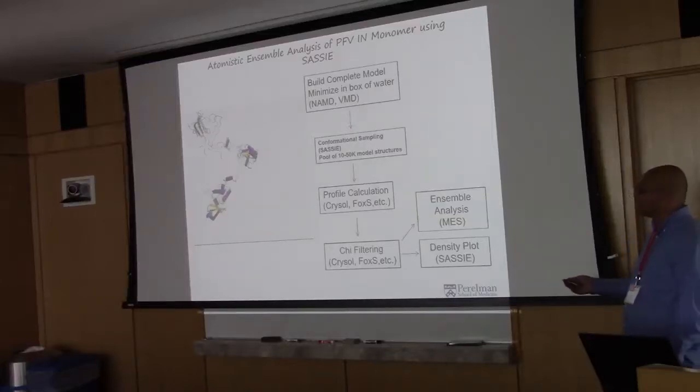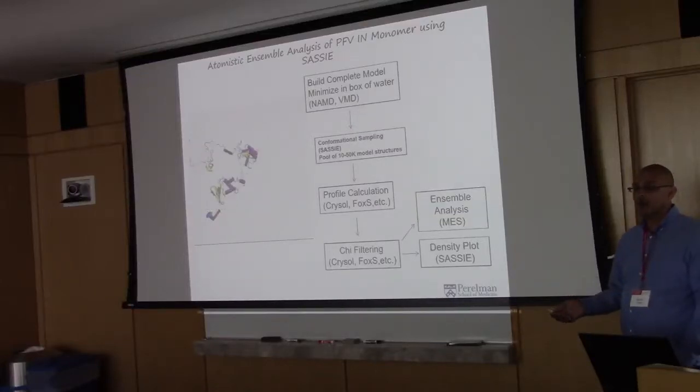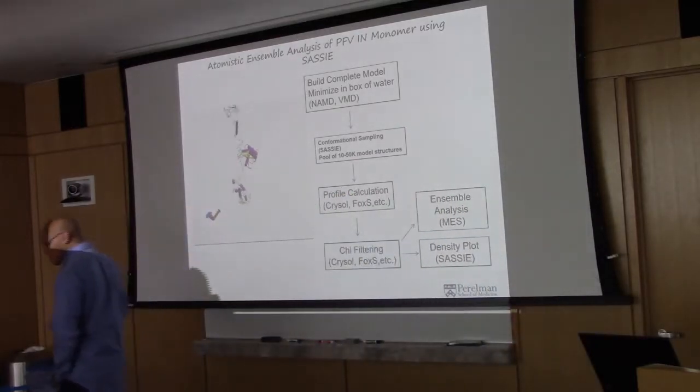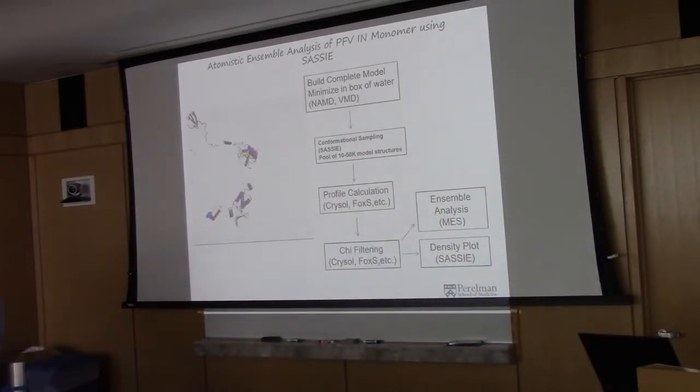So you see this protein dancing here. It seems kind of ridiculous, right? But what we basically did here is you have this crystal structure, and we have regions of predicted disorder. What we simply did was we told the program, sample all conformational space, allowing very specific regions to sample available conformations. We developed a test set that I think initially, for the publication, we used 50,000 models. Actually, I went out to like 200,000 and found that it was overly redundant. We were able to sample enough conformational space with just 50,000.